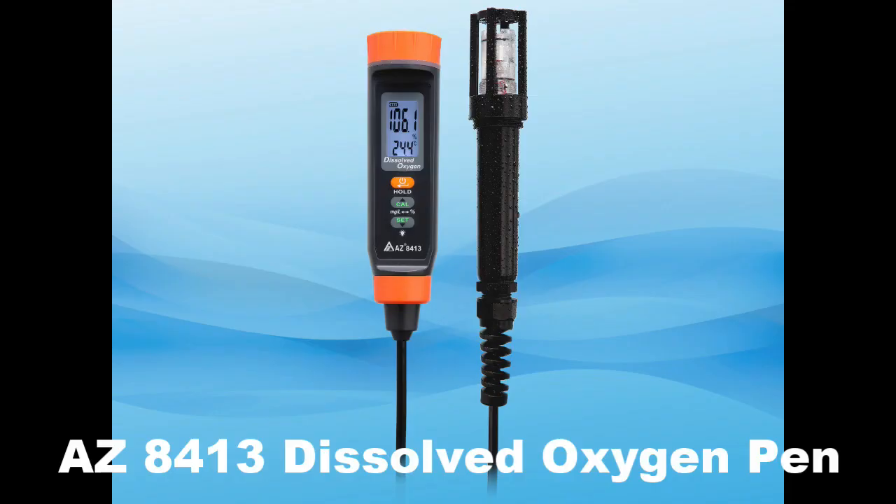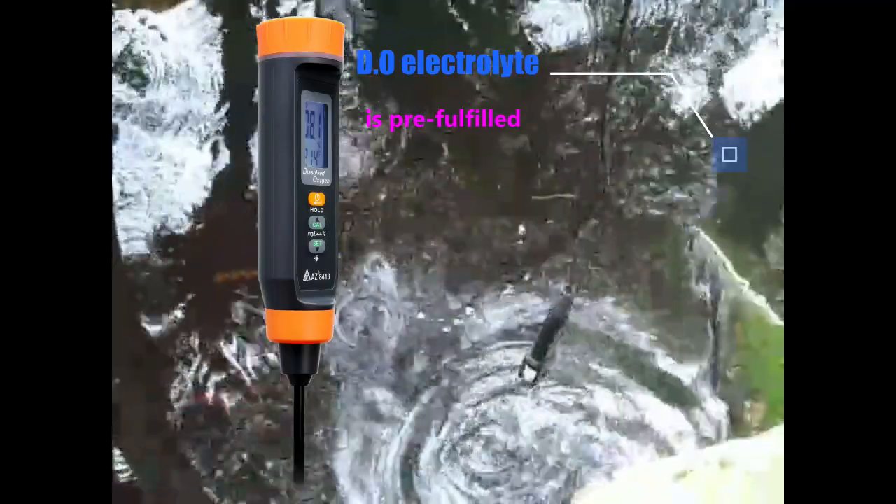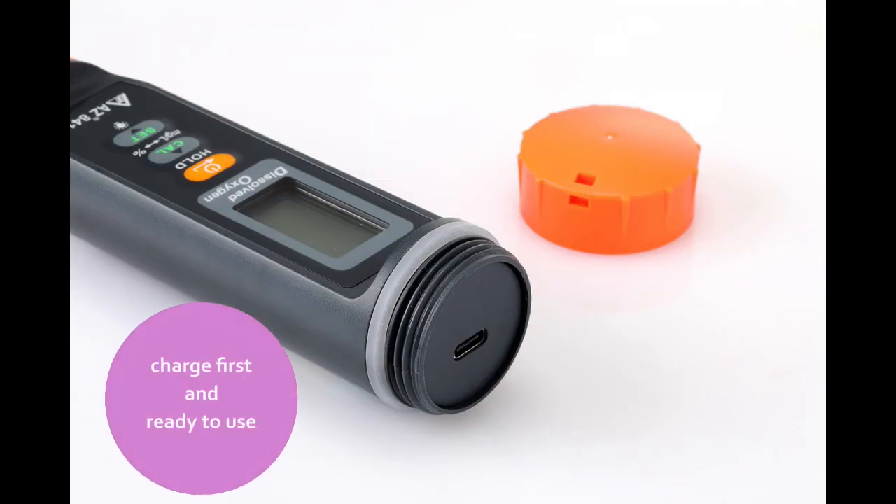Az8-4-1-3 Professional Dissolved Oxygen Test Pen. This product is delivered with electrolyte filled in already, ready to use.